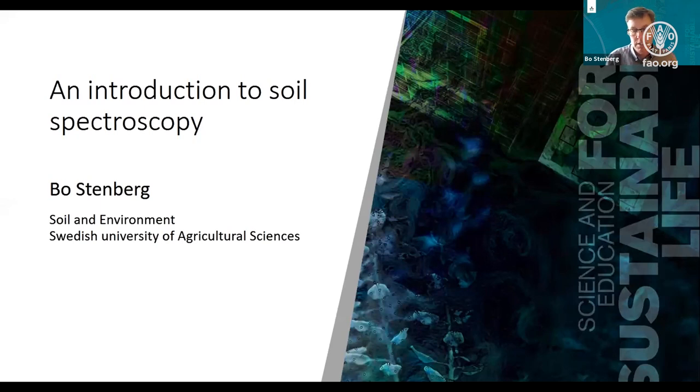So my background is as a practitioner when it comes to near-infrared spectroscopy. What I have learned, and what I will try to talk about here, I have learned by practicing near-infrared spectroscopy on soil and also by trying to understand the things that I think I need to understand. So it will be from a user's point of view, pretty much. But me and my colleagues have also worked a little bit with trying to understand more about what is going on in the soil spectra, what's actually affecting the spectrum.